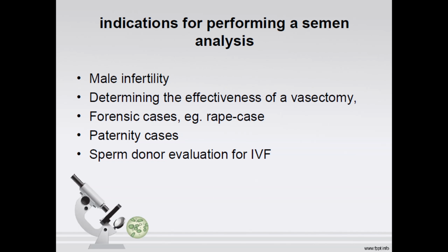Everyone, today I'm going to explain how to examine semen analysis, how to report semen analysis. So what are the indications for performing semen analysis?